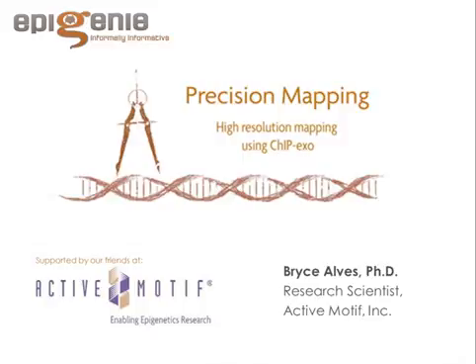Do you know of any examples of ChIP-Exo being applied in bacterial systems and reasons why it may or may not be useful in prokaryotic organisms? I don't think there's any published data for the bacterial systems. Frank Pugh initially produced this assay looking at yeast, so on the yeast level you can get down to it, but I can't see why you wouldn't be able to do bacterial systems. It seems like it would work right along with what you traditionally can do.